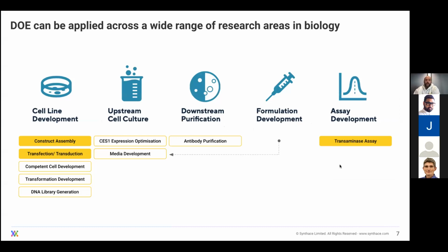In the second webinar, we showed different applications that we have used DOE to understand, looking specifically at examples highlighted here in yellow. And the message very much was that DOE can be applied across a wide range of research areas in biology.